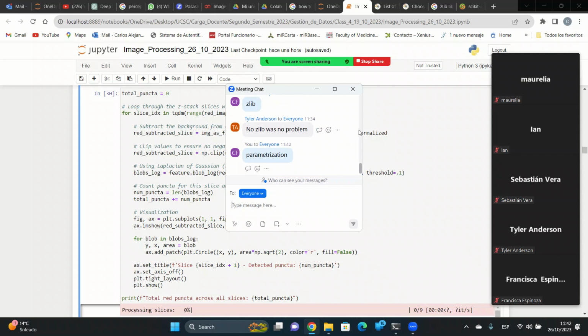That means your method works just for this data, not for every single dataset. So that's the aim of machine learning and deep learning: a method that is as consistent as you can make it, that tries to generalize and process a lot of images at once.